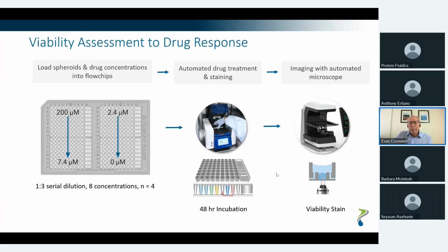Again, compatible with 384 well liquid handling and 384 well imaging systems. So once the concentration has been set up, we use the Pu.Ma system to do the incubations, and then we did imaging at the end with the automated microscopes.